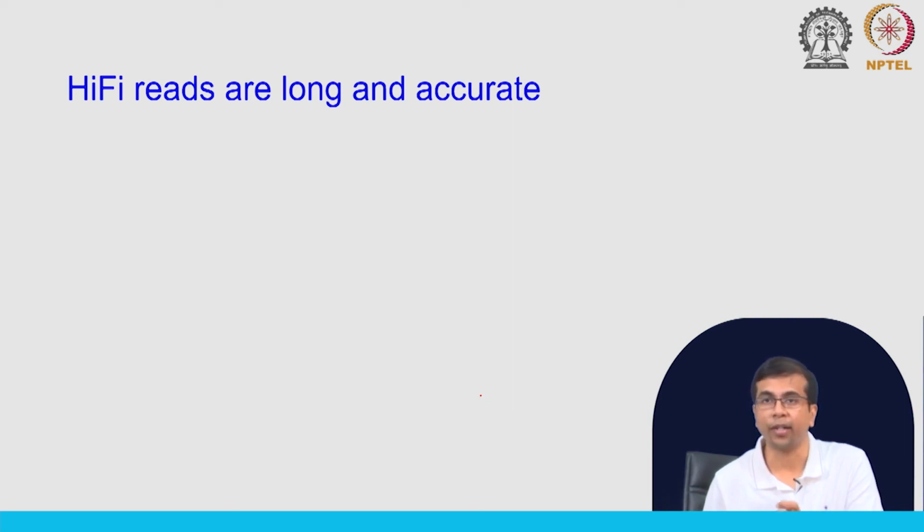Okay. This is really game changing, because what you have seen so far is that short read sequencing methods are very accurate, which is good, but they have some drawbacks. To counter that, long read sequencing was developed, but it had a higher error rate. If you can sequence long reads and also get really accurate data, that is the ideal situation. This is very helpful and useful for all sorts of purposes.